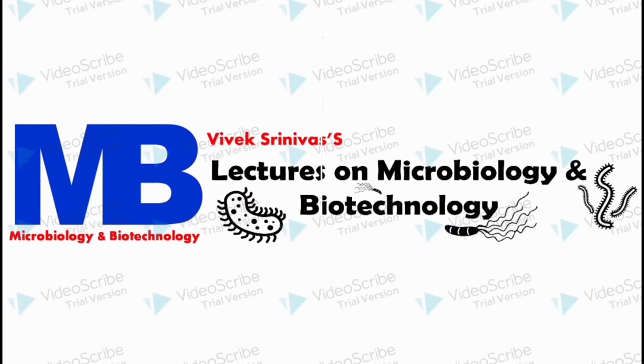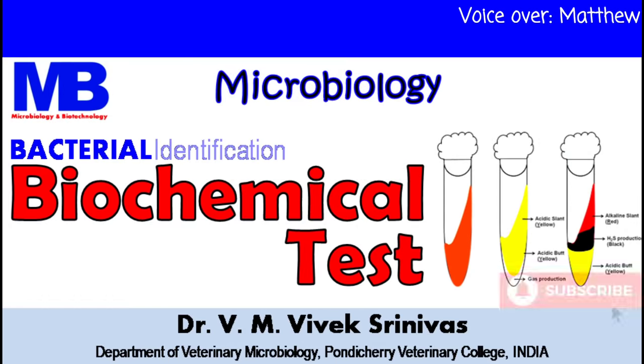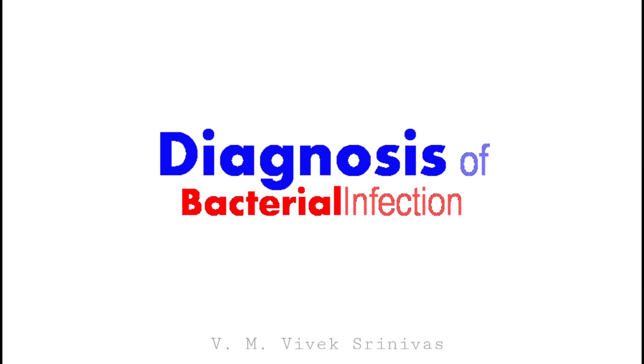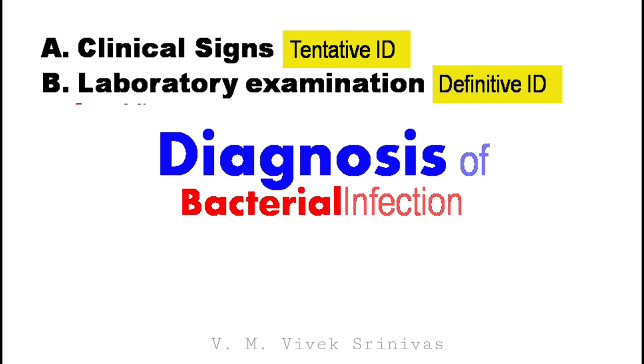In this video presentation, we will see about the different biochemical tests for the identification of bacteria. The diagnosis of a bacterial infection can be done based on the clinical signs and symptoms of the disease, but it gives only a tentative identification. For the definitive identification, laboratory examination is necessary.